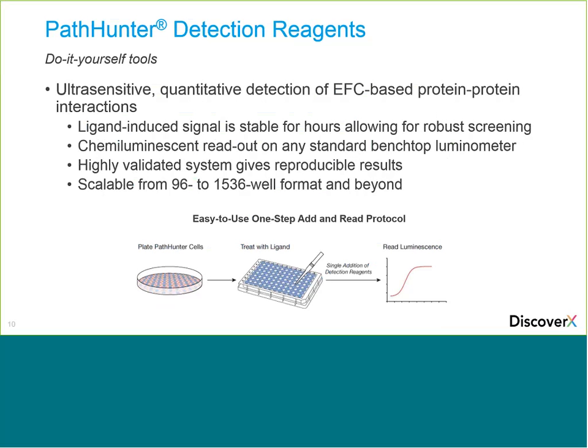So let's look at the example to the right. You're looking at a cholecystokinin A receptor, the GPCR, and investigating the beta-arrestin recruitment in 3 different parental cell lines. The CHO-K1, which is a Chinese hamster ovary cell line, HEK-293, human embryonic kidney, and then U2OS is human bone epithelial cells. And you see, using the ligand CCK8, you only see slight differences between these different cell lines, but a slight bias towards CHO-K1 with a 10-fold greater ligand potency, or EC50 in this case.